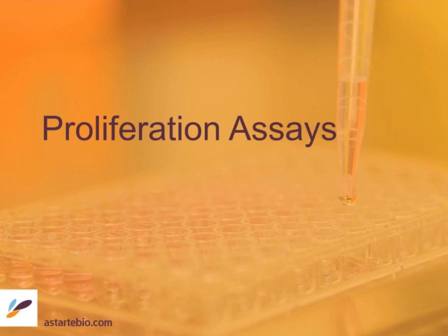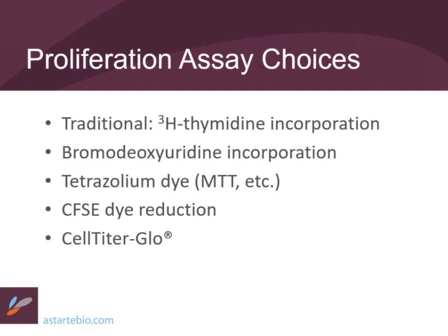So the first section is proliferation assays. The choices that we have here are the traditional tritiated thymidine incorporation, the next generation bromodeoxyuridine incorporation, tetrazolium dyes of various sorts and colors, CFSE dye reduction, and CellTiter-Glo, or measurement of ATP.